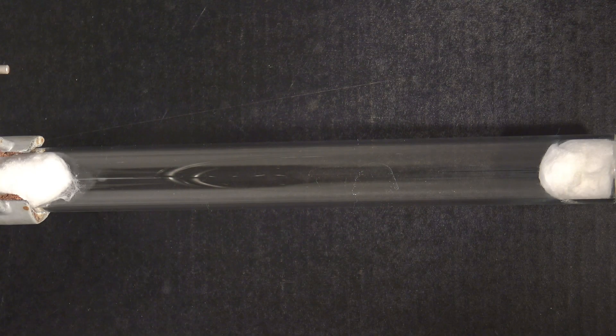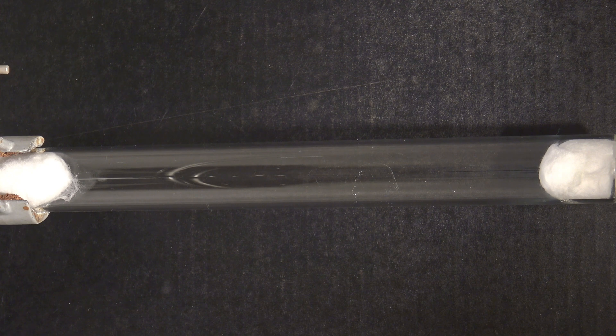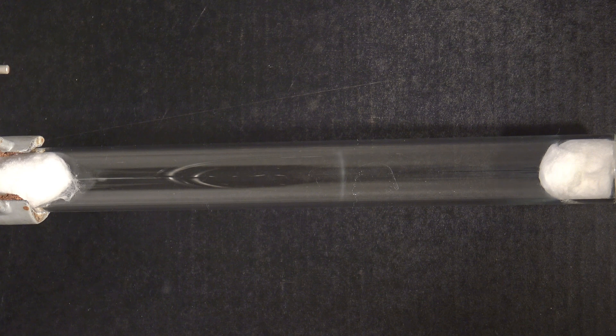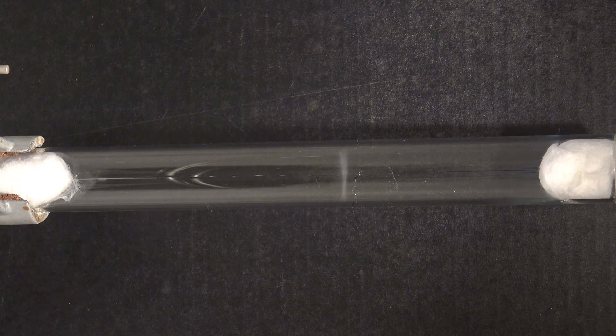This glass tube was closed with two pieces of cotton, of which one was soaked with ammonia and the other one with hydrochloric acid. When the released gases meet, they react to form ammonium chloride.